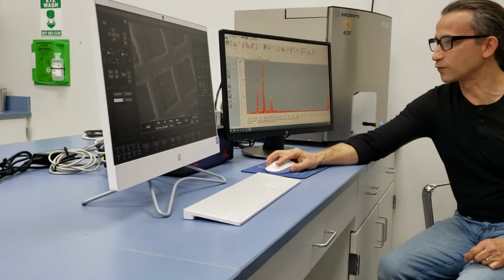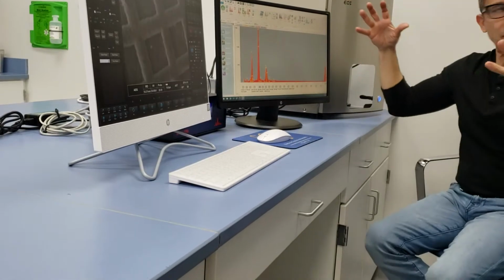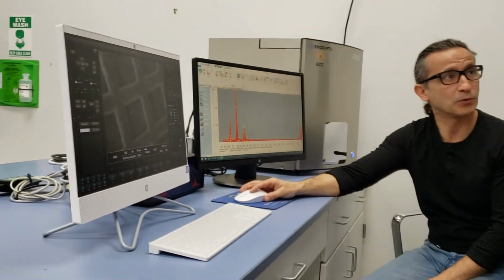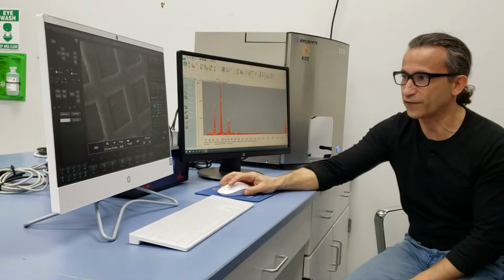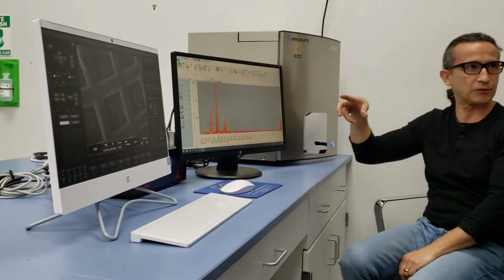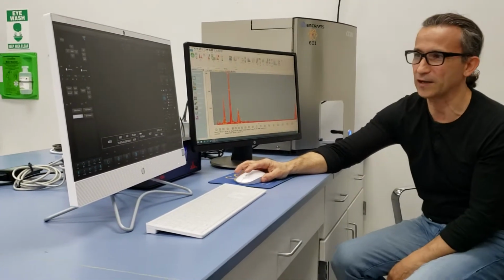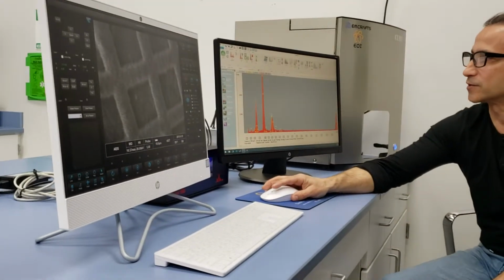all I wanted to go over realistically was this relationship: beam diameter gives us more X-ray counts per second, 50,000 X-ray events per second, right? The diameter of the beam gives us more counts. If I was to close the beam, and how else can I simulate closing the beam besides changing an aperture, right? I can simulate closing the beam by changing my probe current, right? So I can use probe current from 20, run it down to 5. This is going to get really dark all of a sudden, right? And look what happened to my X-ray counts.